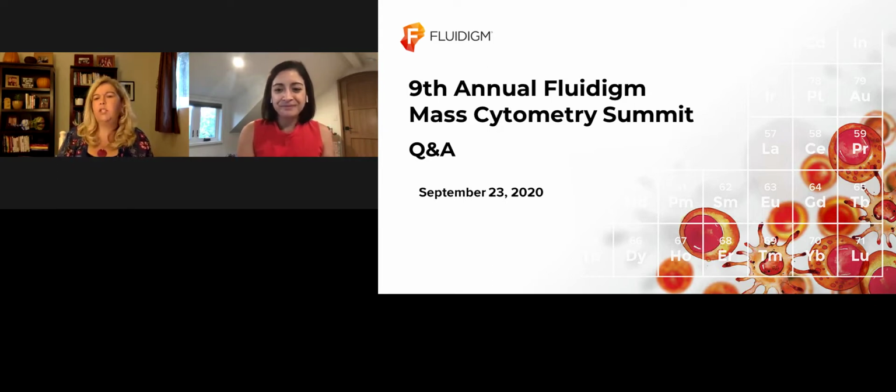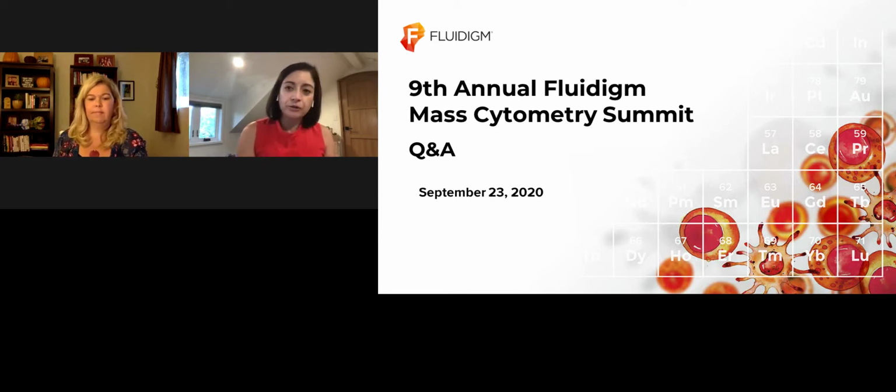Thank you so much. Now, do you potentially see a role for using mass cytometry for assessing minimal residual disease in general? Yeah, so great question. We actually have a whole other project working on that, led by another postdoc in the lab. And I'm not sure that I see a CyTOF in every clinical lab, but certainly we are learning that if you assay a lot of different proteins and look at a lot of different markers, you can potentially identify the best set of markers to look at, for example, minimal residual disease. And so I think that there absolutely is a role. We know that both with the ability to look at so many proteins and the analysis techniques, we are really nicely able to find abnormal cells, which for us clinically helps us guide treatment decisions.